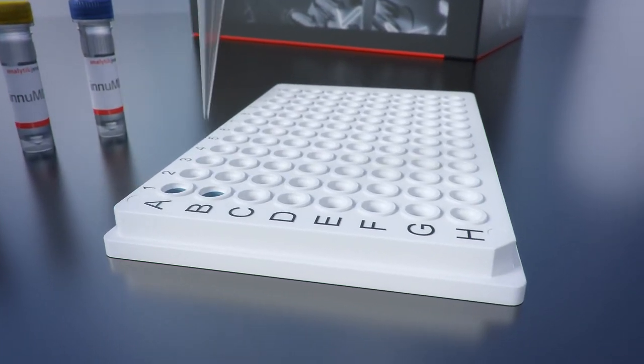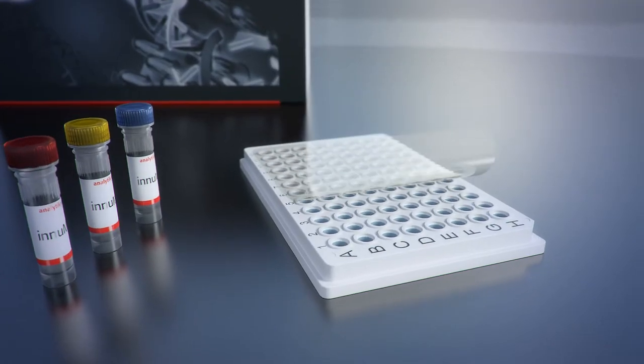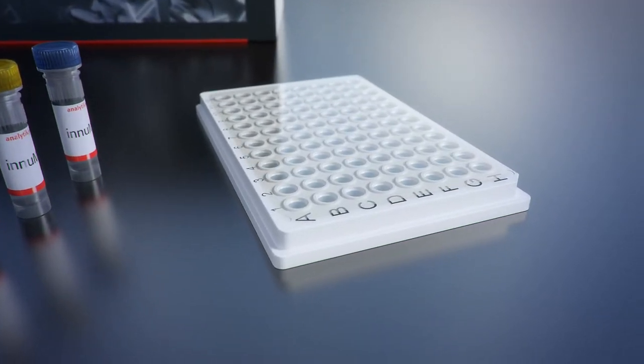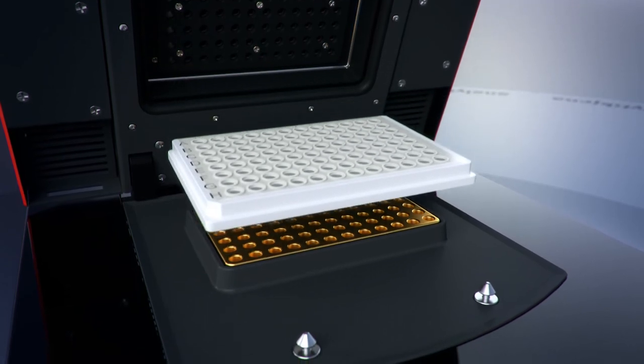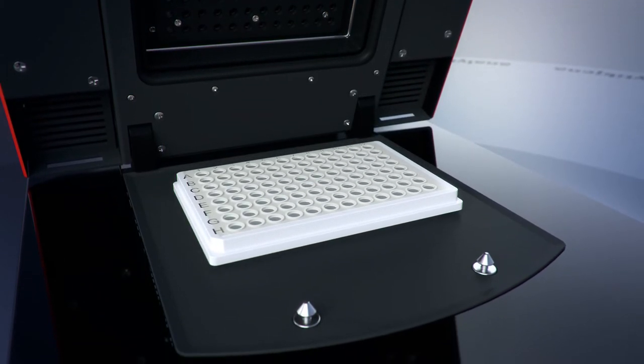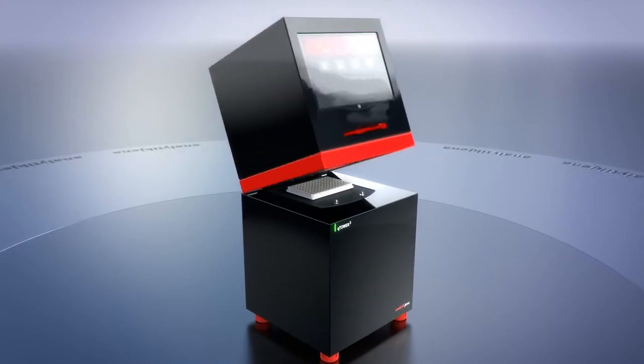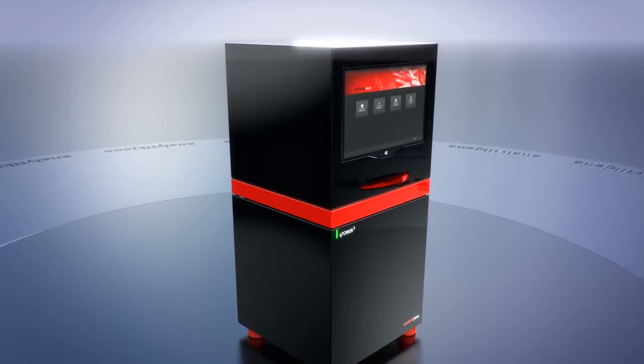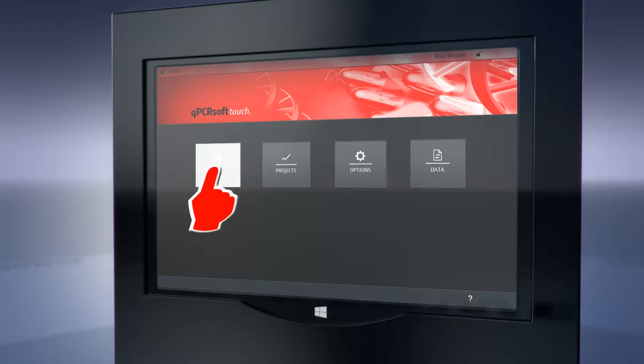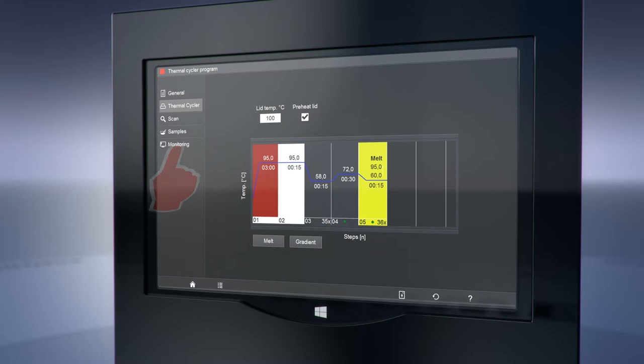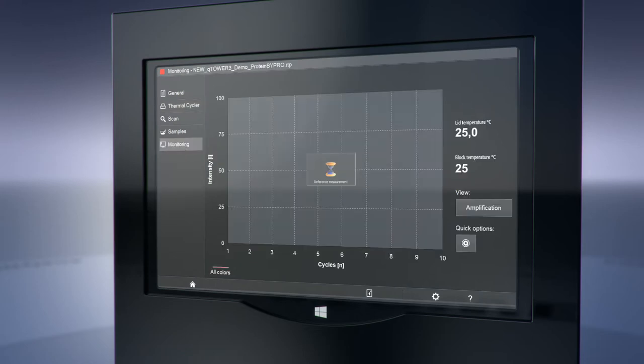Jena offers ready-to-use master mixes for intercalating dyes or probe-based assays, as well as InnoScript kits for reverse transcription. Utilizing these optimized kits, Q Tower 3 provides reliable reactions in a wide volume range from 10 to 80 microliters, regardless of performing simple singleplex or highly sophisticated multiplex applications.